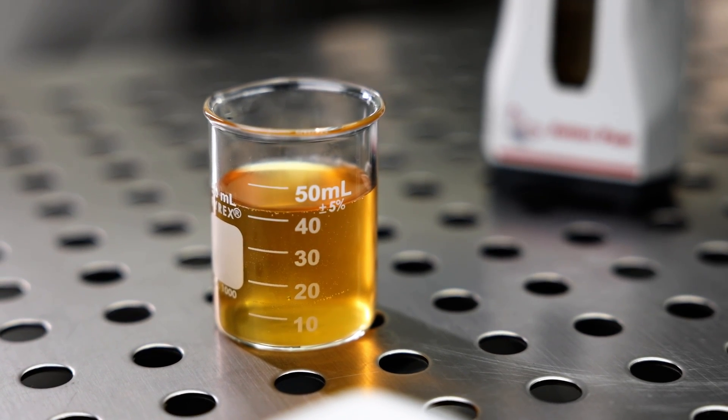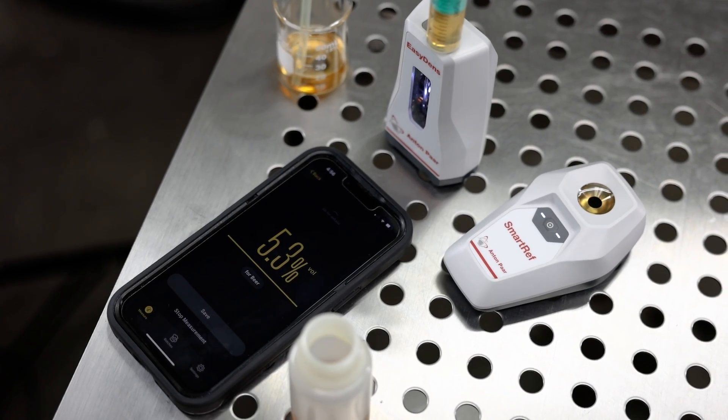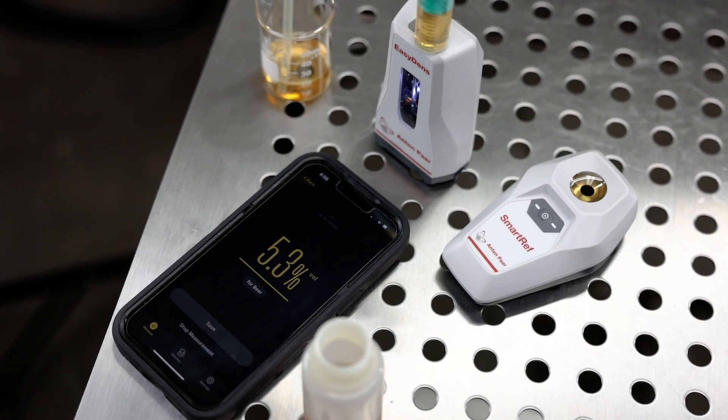Since wort is not just a composition of sucrose and water, adjustments such as wort and alcohol correction are applied within the Brewmeister app to measure beer parameters with extreme precision.